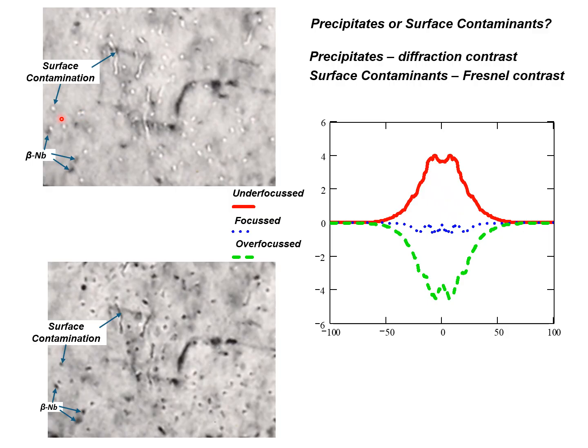They'll show this dark, bright image. So anybody who says, oh, I have cavities, I did the Fresnel contrast inside and outside, they're dark here and bright there, that proves they're cavities. No, you still could be looking at a surface artifact.